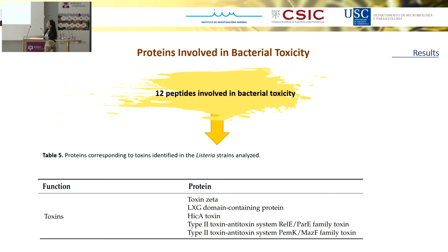Moreover, we identified 12 peptides that are involved in bacterial toxicity.